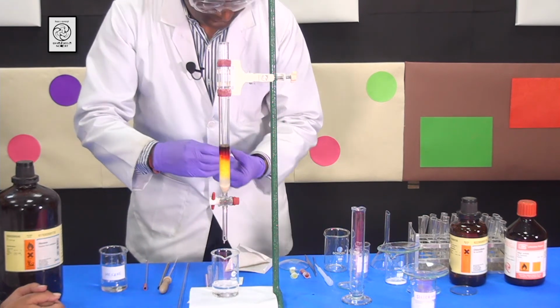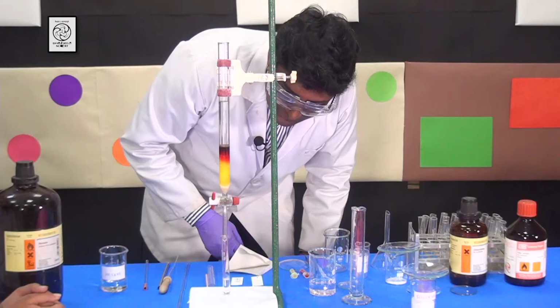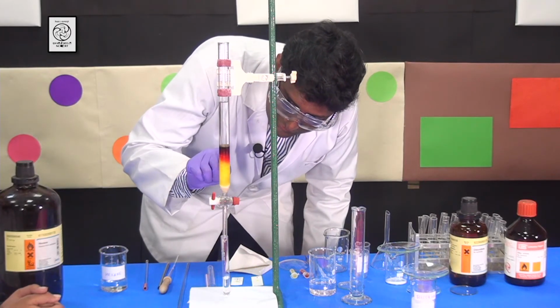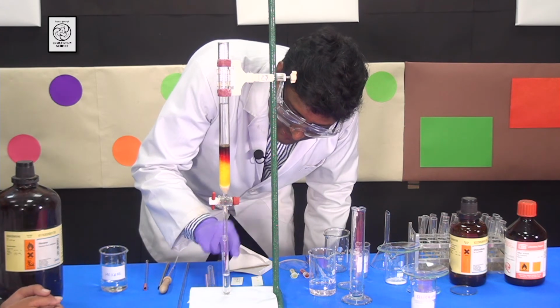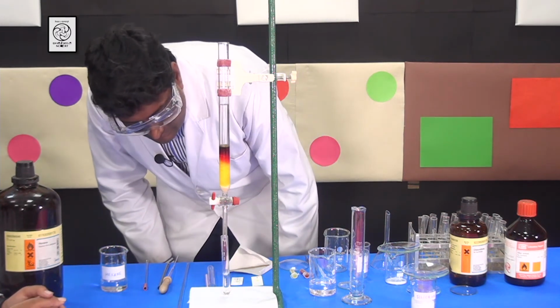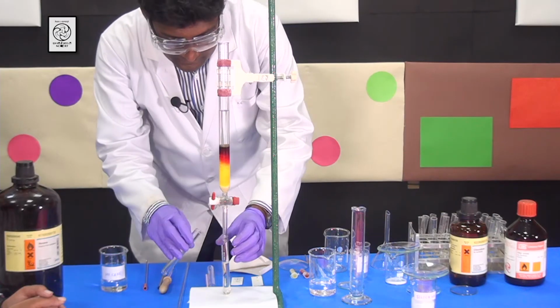Now at this point we need to take the test tubes in order to collect the compounds. You can see that slowly the yellow compound is coming. However, we are not collecting it in the test tube yet, we will slowly collect it. Now you can see that the solution is becoming more yellow.